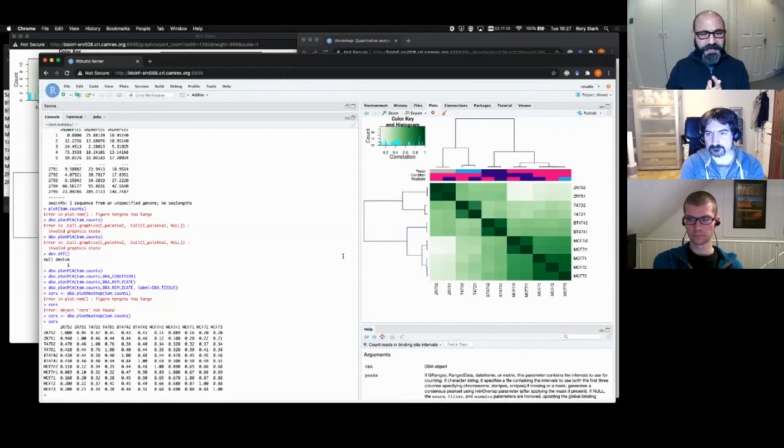The ChiP-QC package has some other plots that compare replicates and compute some statistics. There's the cross correlation statistic to see how well the whole enrichment profile, rather than just a single correlation measure, compares, a normalized comparison of that in the ChiP-QC package. Okay.